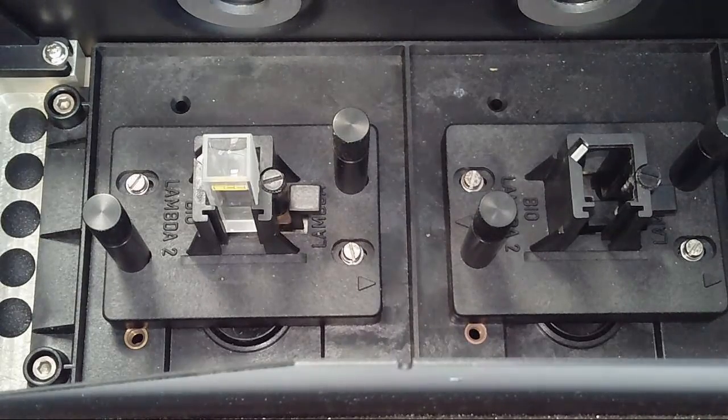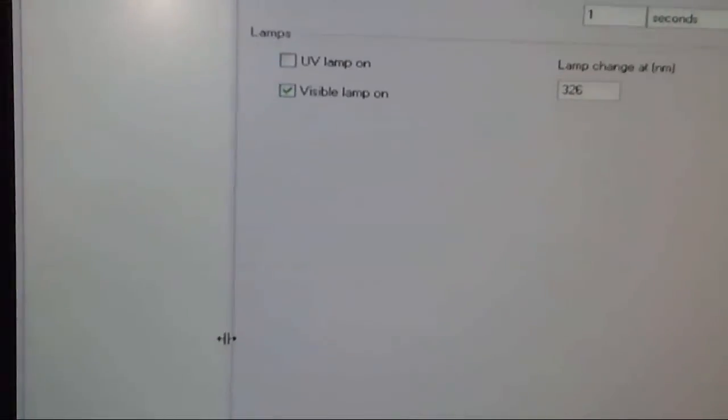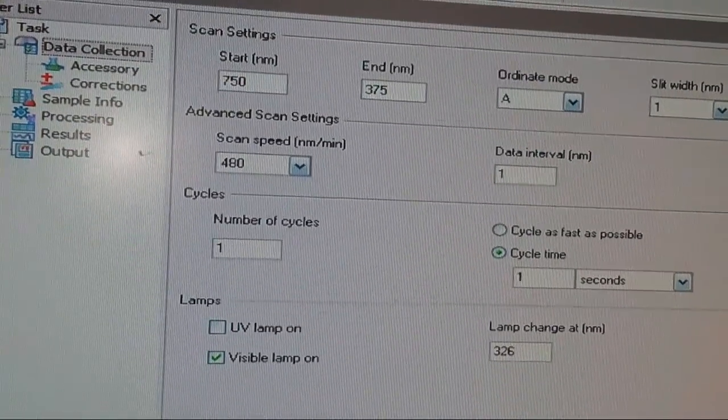So we can shut our... okay, focus back over on the... Awesome. This is definitely cringeworthy. Best video ever.